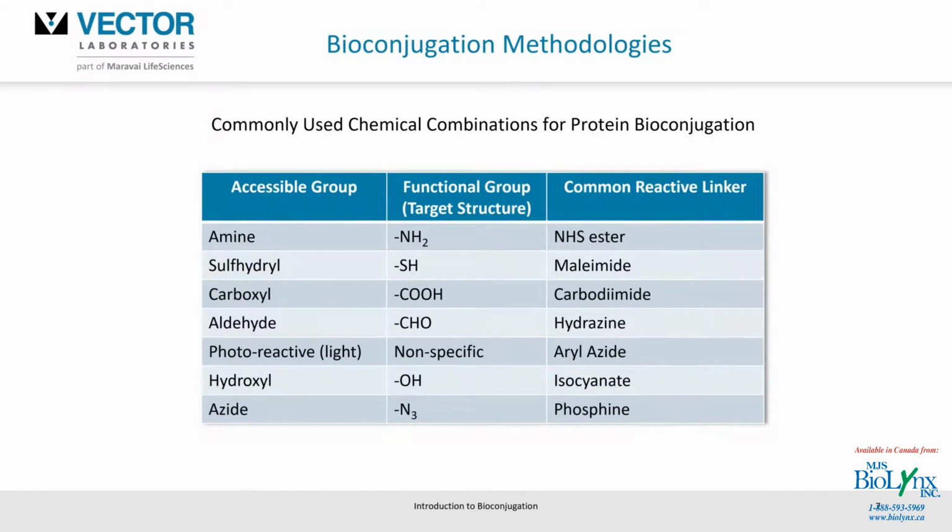Since primary amine groups are readily accessible on things such as antibodies, they're usually the most popular method of targeting or conjugating antibodies. And then I'd say the next is probably the use of sulfhydryl groups through some modification. We'll be talking a little bit about the linkage of an aldehyde and hydrazine, which is the basis of the Solulink chemistry, a little later on.